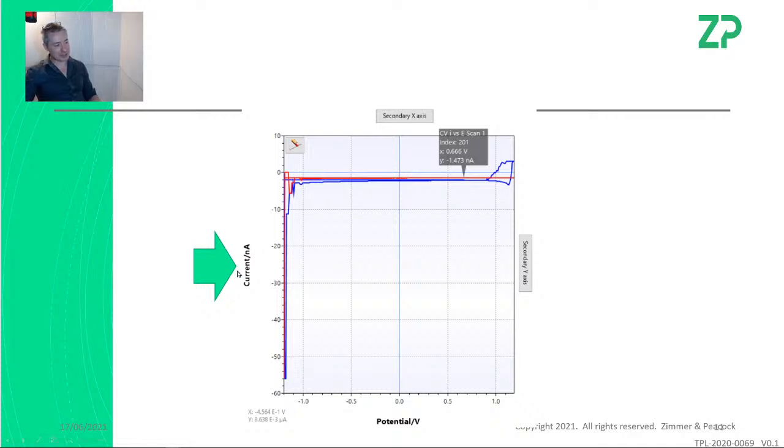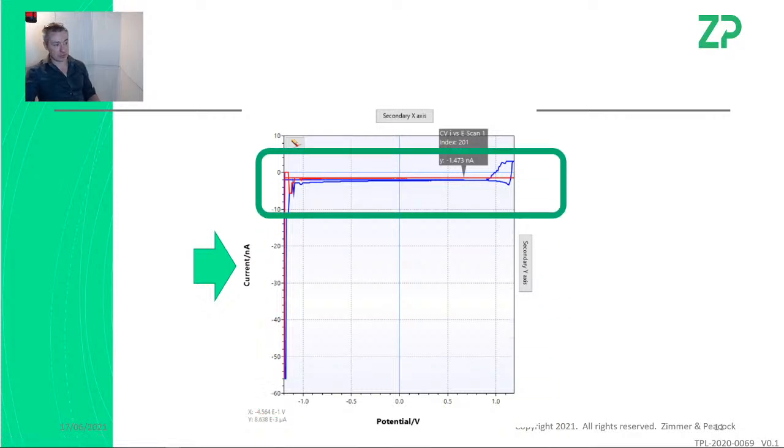So what you see here is they say there's electrodes that don't work, and the first thing you notice is this is nanoamp, right? It's also around about 1 nanoamp, which I know is the limit of this particular instrument. And then they get some features here which are really just the electronics messing around, because the electronics basically don't know there's a sensor there, and I'll explain what I mean by that in a minute. So this entire thing is in this box of like 10 nanoamps. They've really got nothing going on here.